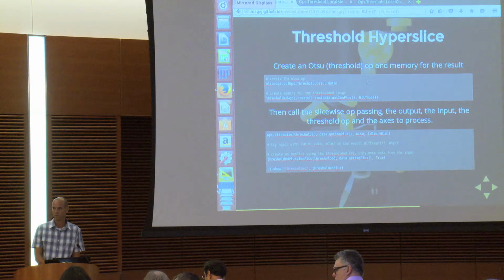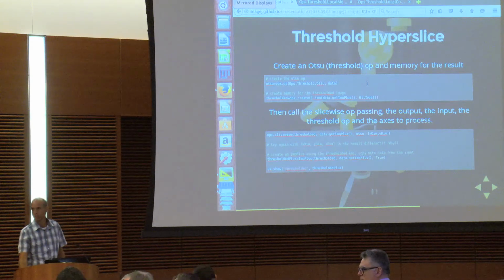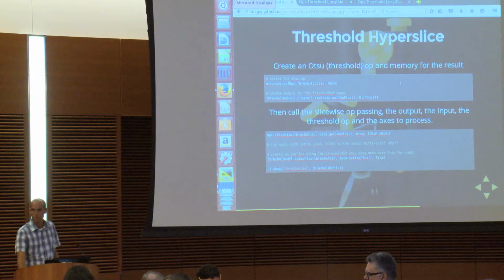There may be other parameters involved, but those are secondary. Even for something like adding a constant to an image, the image is the first-class thing that I want to work on, and the constant I just fix and leave fixed. It's like the difference between independent and dependent variables. What you want to do is loop the same op over multiple inputs, and defining whatever the special input is makes a big difference for the structure.